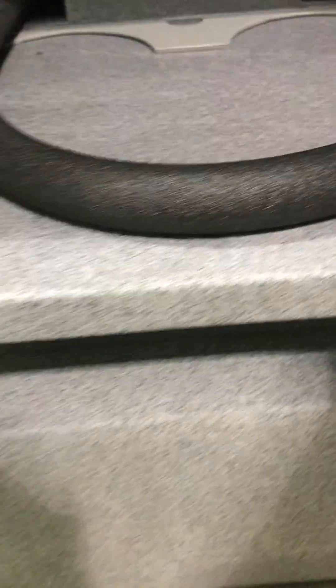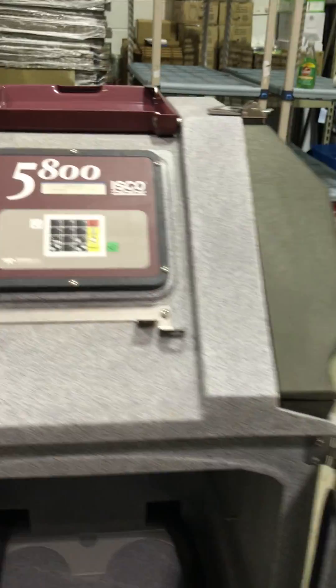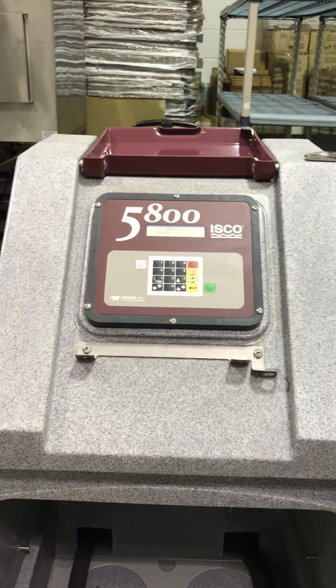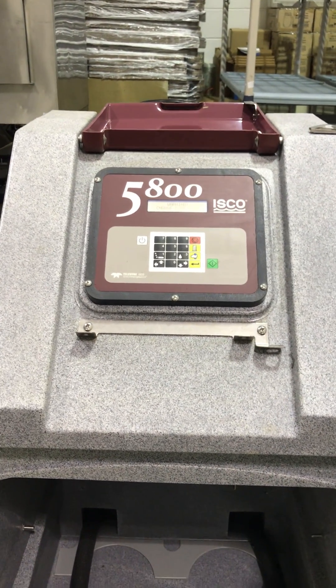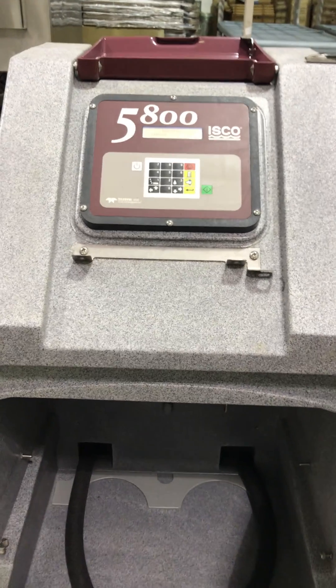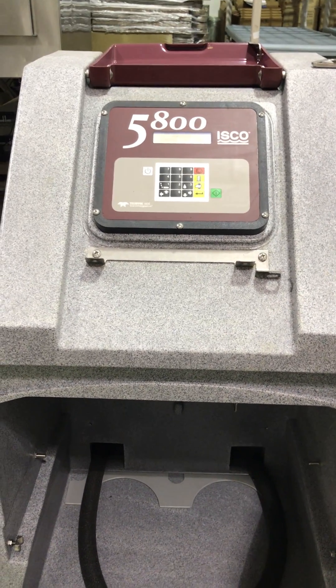I'm not super familiar with these units, but from everything I could tell, there's the label on it. It appears to be in exceptional shape. And with the exception of tubes, I think this unit should be good to go. Any requests, just go ahead and message me for the tests you want me to run — any information I could give you to help you make a better decision on purchasing this unit.